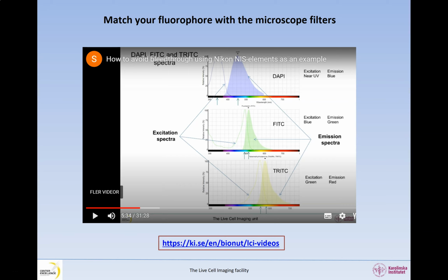Watch the bleed-through video found on our website to understand how to check if your fluorophores will work with the filters available on your favorite microscope. Google LCI facility to get to our website, and under LCI videos you will find the bleed-through video.